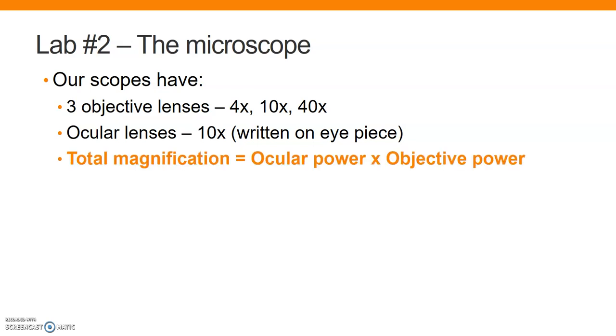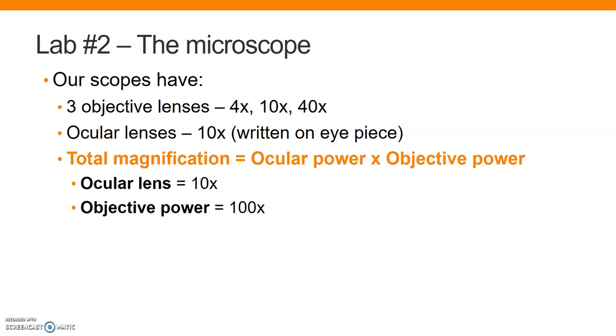So the way that we can figure out what's called total magnification, how much magnification are we actually using if we are using the objective lenses and the ocular lenses? So it's simple, really, like we're just magnifying them together. So we have to multiply the 2 powers together, right? So we're going to take the ocular power of 10x and we're going to multiply that times the objective power. So if you're on scanning at 4x, the ocular is going to be at 10x, right? So it would be a total magnification of 40, right?